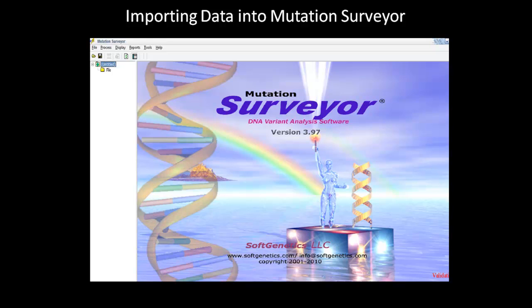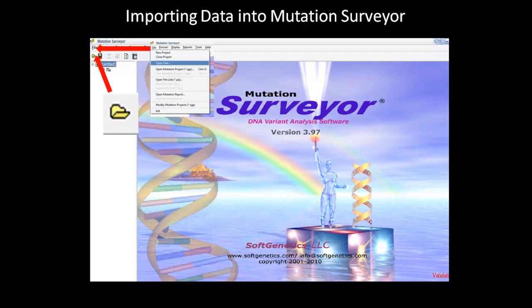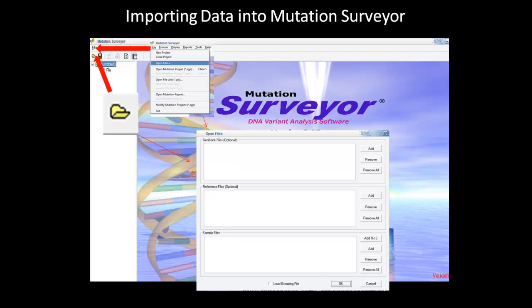There are two ways that you can import data into the software. The first is to use the File drop-down menu and select the Open File option. The second way is to simply click on the folder icon located under the File tab. Both methods will bring up an Open Files dialog box which you can use to import data into the software.